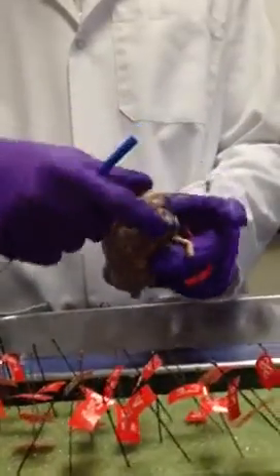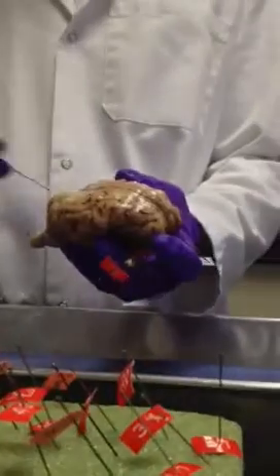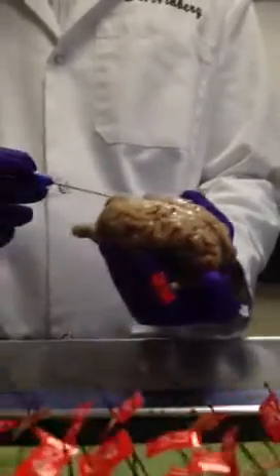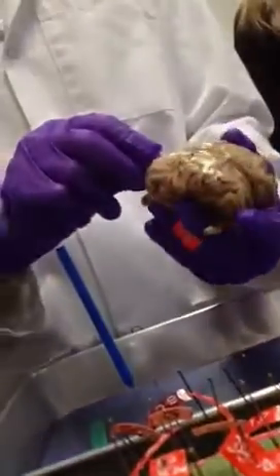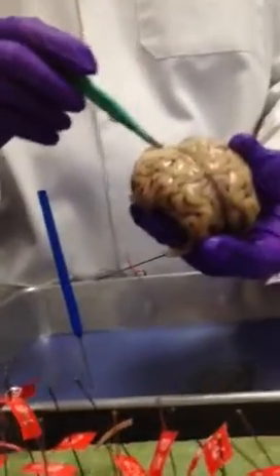So all this is cerebrum, cerebellum. There are two main hemispheres. There's the vermis in the middle. And let's look at posterior first.